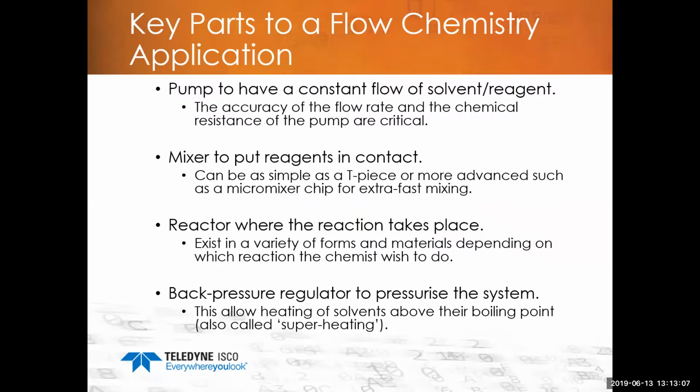To success of your flow chemistry application, you need some type of a mixer to put reagents in contact. You can use mixers with blades and spin them around, or as we saw earlier, you can run them through a T-piece or run them through a microfluidic reactor or a larger reactor for faster mixing, to cause things to start to happen before it gets to the collection device.